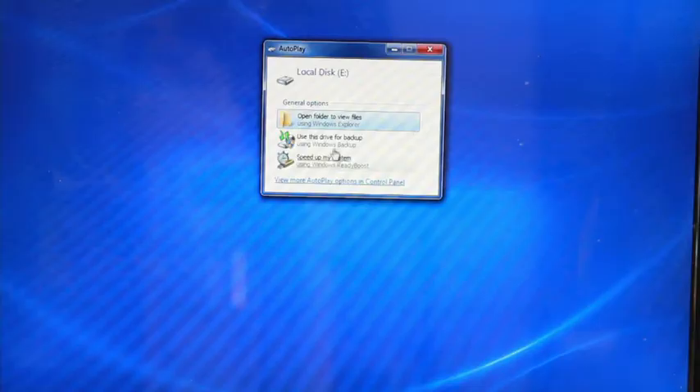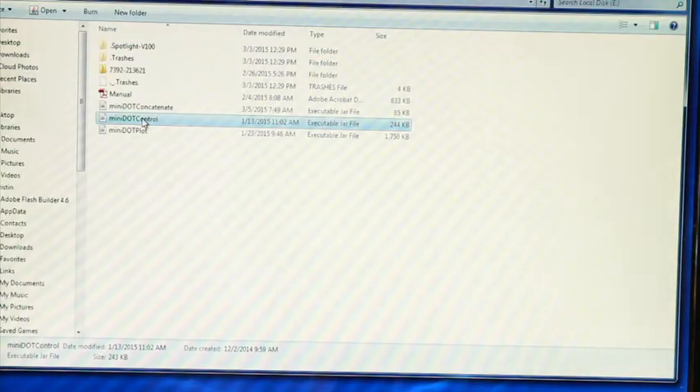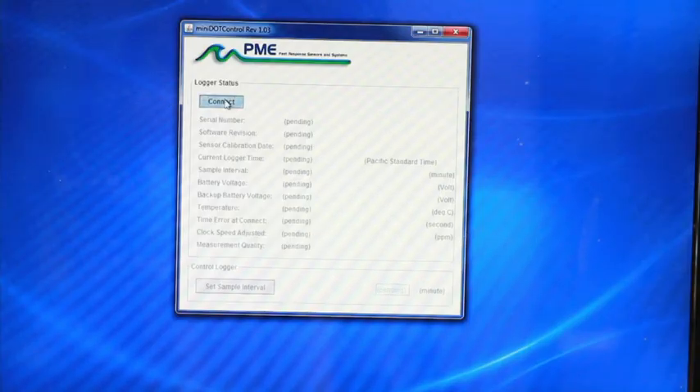The computer should install any necessary drivers needed to operate the logger. Open the mini dot control dot jar program, which can be found on the mini dot logger. Once the display program opens, click the button that says connect.